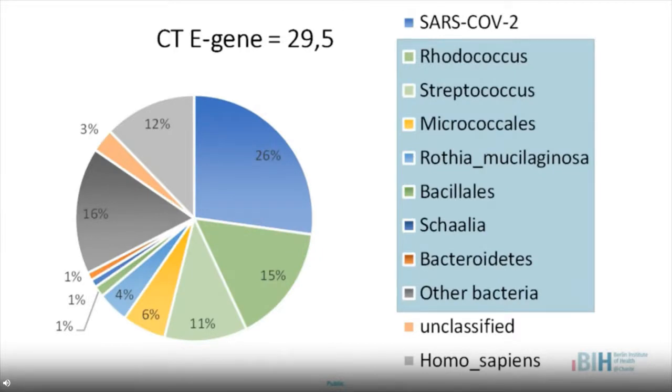Application of our RespVir pipeline resulted in classification of almost all of the unclassified sequences into bacterial strains, strongly suggesting as a source bacterial species present in throats of analyzed patients.